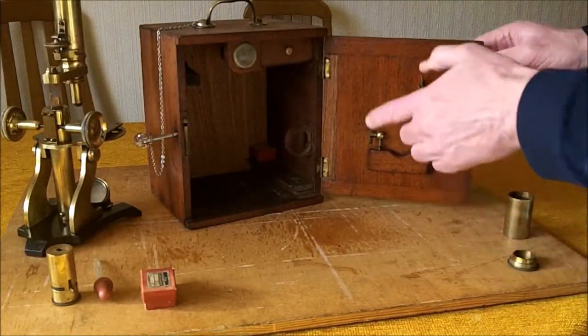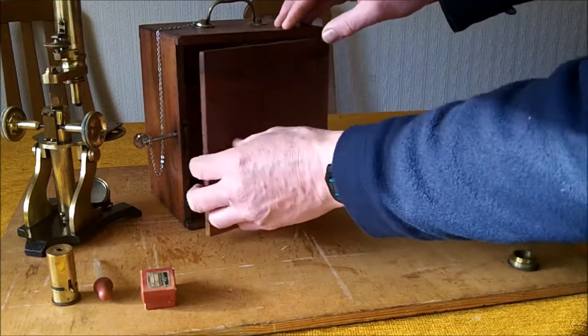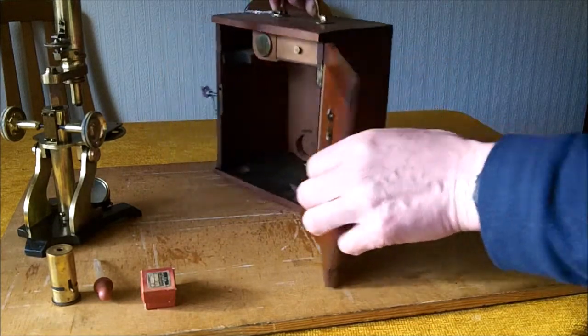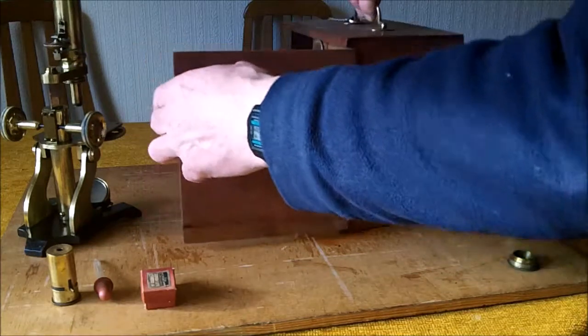I also repaired the microscope case door, as you can see here, and also fitted a new back to the microscope case.